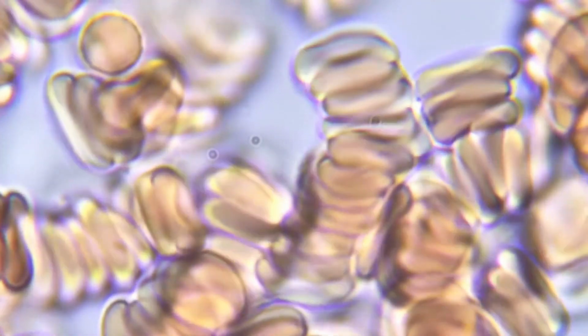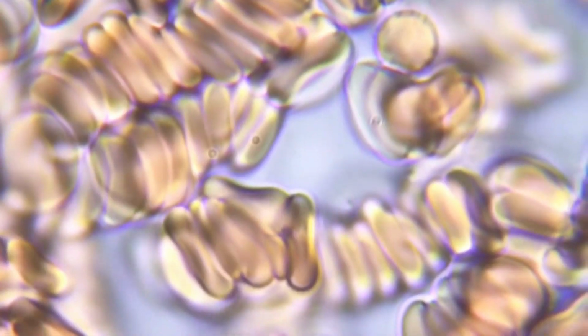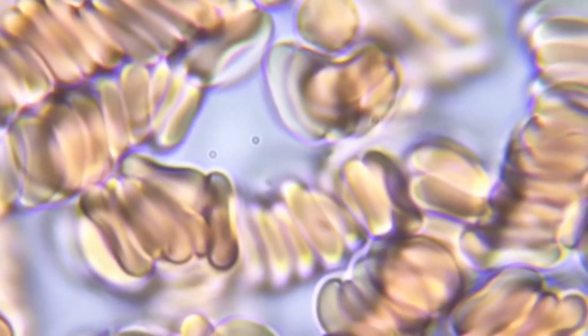This is a 5,000 times magnification. Let's also take a look at what's happening with the bacteria. As we can see, the number of bacteria hasn't increased, but it hasn't decreased either. I see a couple of bacteria here and there. Here, 2, 3, 4. So just a small amount, really not many at all.